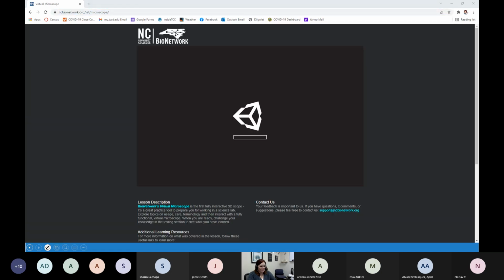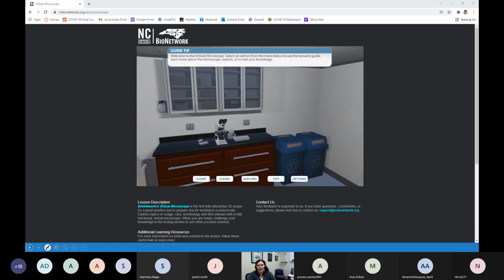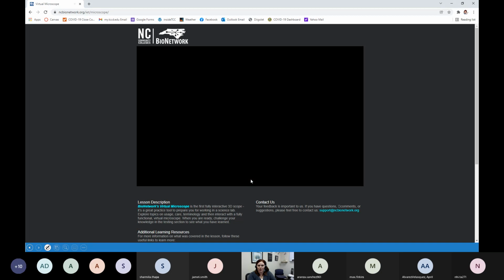All right, I am pulling up something new for us. It's loading on my screen, and I'm giving you the link to this as well to help us see a little bit in 3D with these microscopes. I'm taking you to a website that has a virtual microscope. So I've put it in the chat if you want to follow along with me or play with it later. We're in a virtual lab working with a virtual microscope. So I'm going to explore here. We're going to play with the microscope a bit.